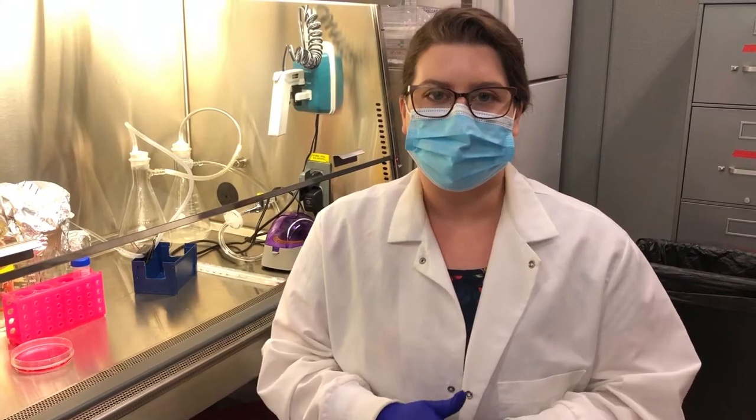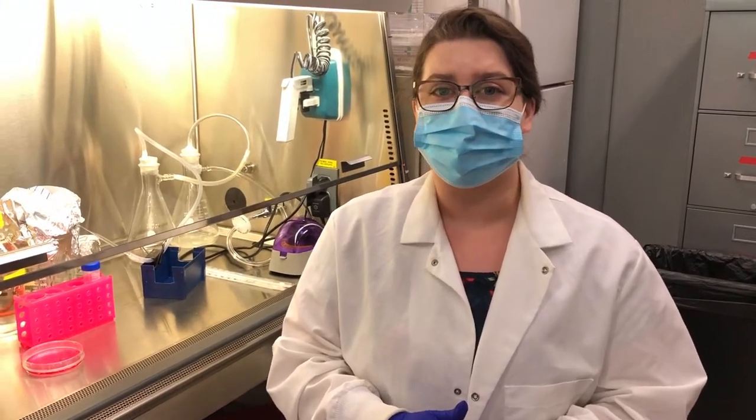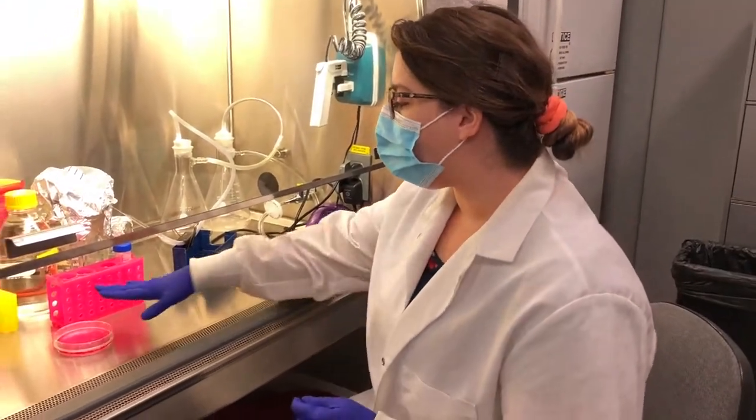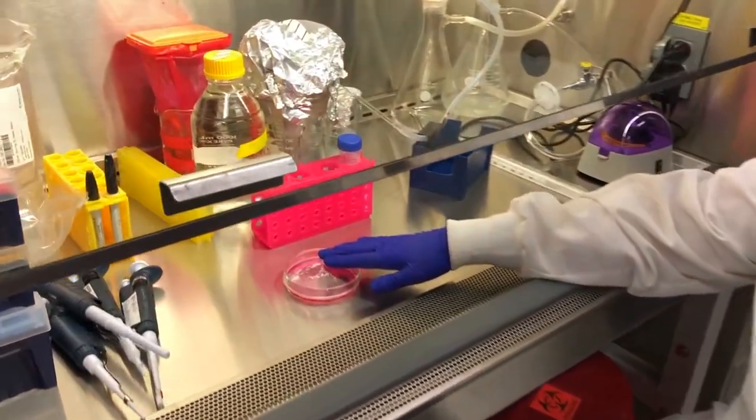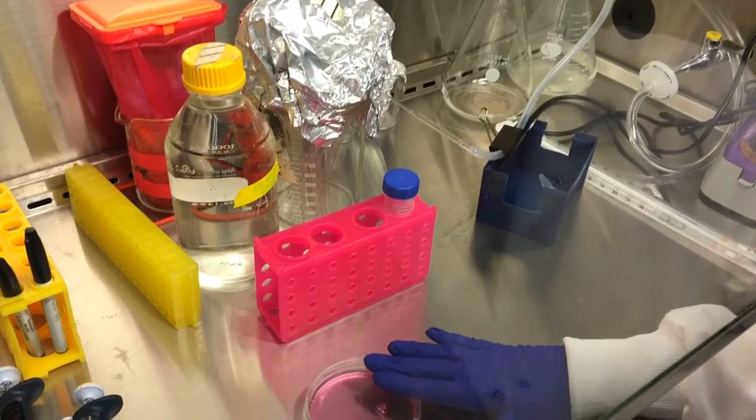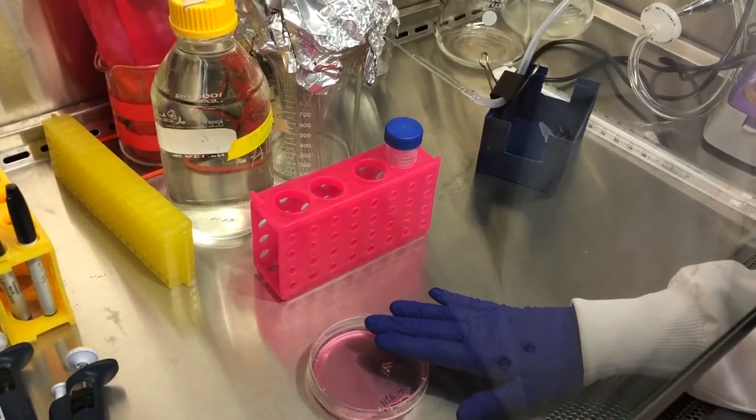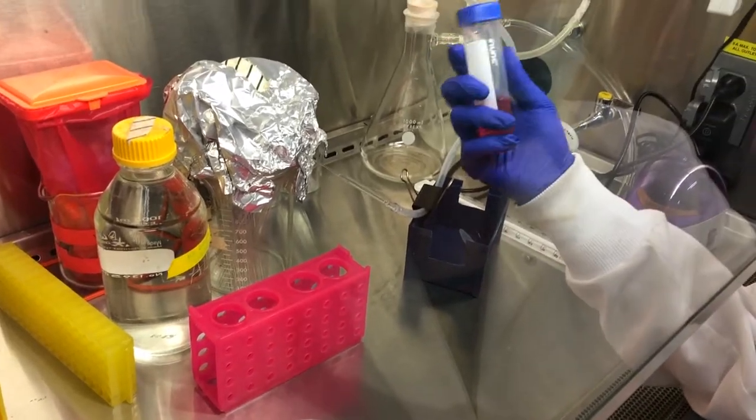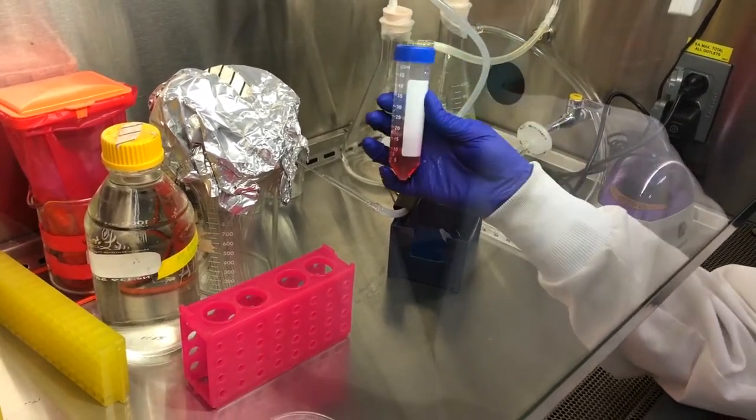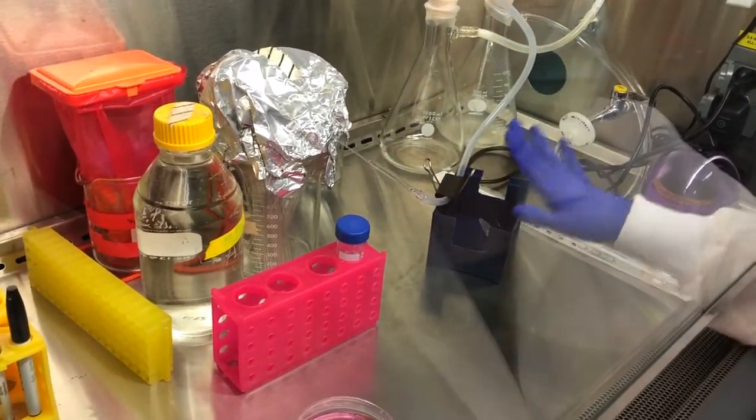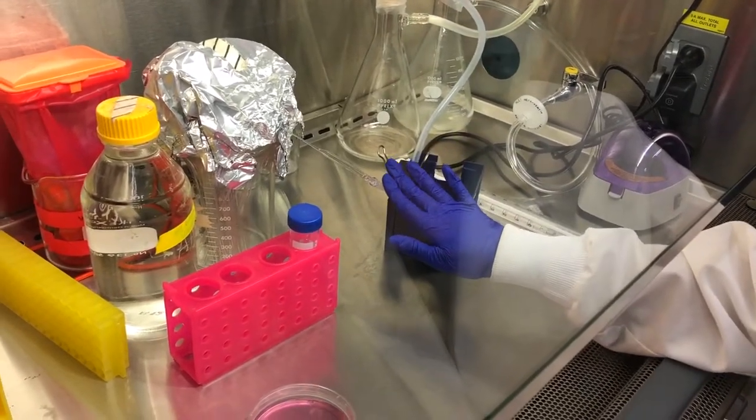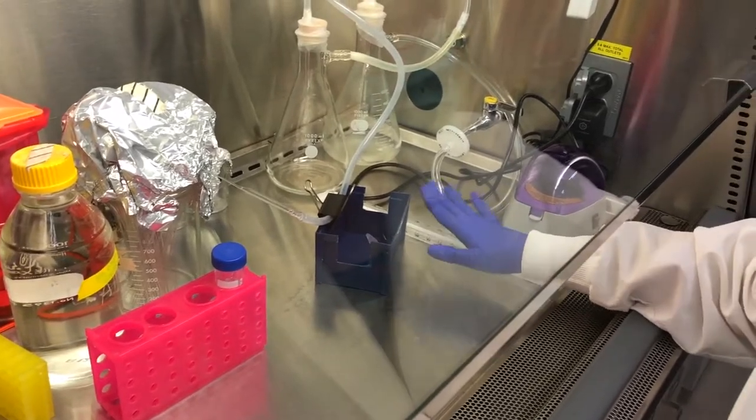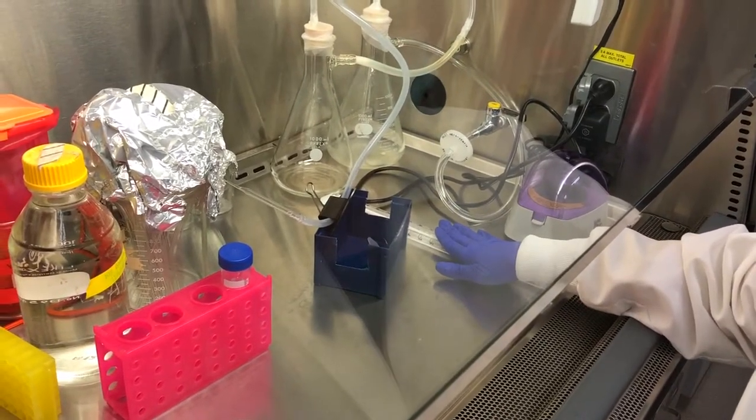So today in our example we're going to do something called a one to two split. So here we have our tissue culture plate with our cells. This dish contains 10 mils of media. We also have our fresh media that's been already warmed. We have our glass pasture pipette already connected to the vacuum. And we have our 10 mil pipettes.